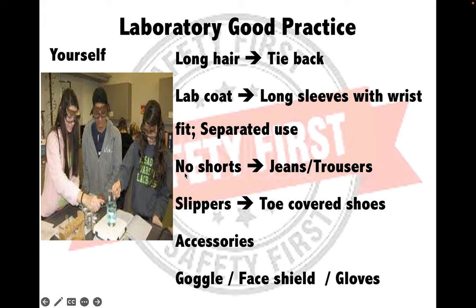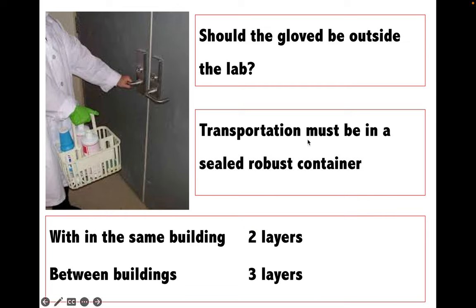Regular lab coat laundering is a must, and it must be separated from normal household laundry. No shorts, slippers, or accessories — you must wear trousers and closed-toe shoes instead. Goggles and face shields are required in certain circumstances. Like the gloves — you should select the correct type of glove for your work. It is strongly recommended that gloves must not be worn outside the lab; however, if necessary, wear one glove on one hand and touch environmental surfaces like doorknobs, elevator buttons, and telephones with the glove-free hand.